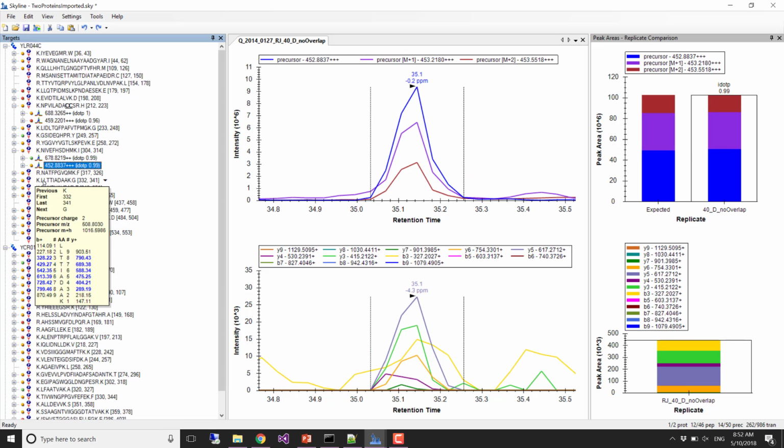But anyway, so now let's go and see. Well, actually, I guess we're running out of time even. So, any questions? We can pick this up later. The rest of this section is to actually use some DDA data to inform ourselves better. But you can see that you can figure out some of these things, and there are tools that have emerged now that can find this type of match in DIA data. So this is what DIA-Umpire is going to do automatically, is to find these matches of precursor ions with product ions.